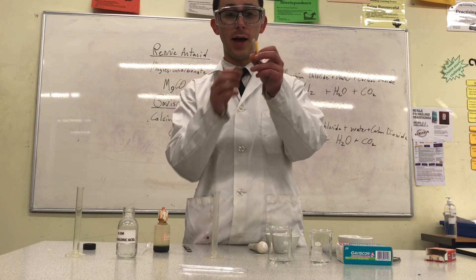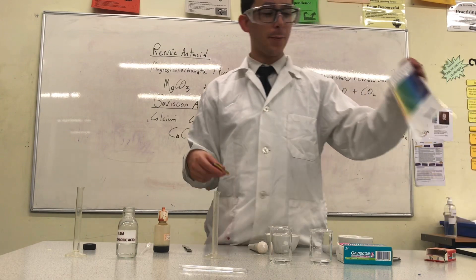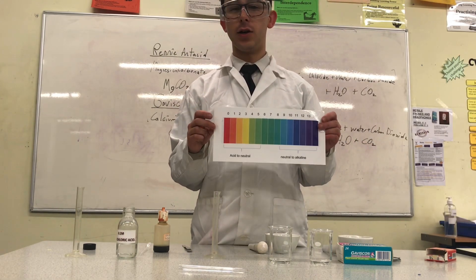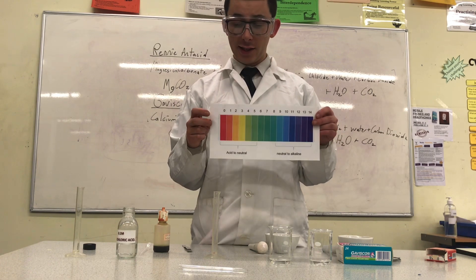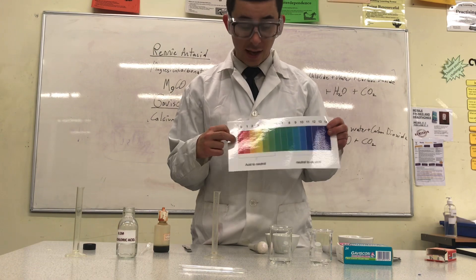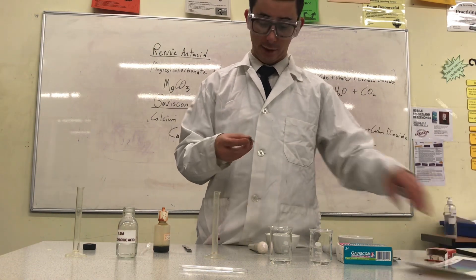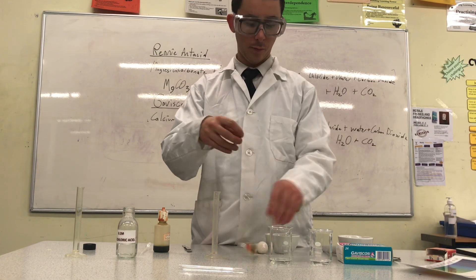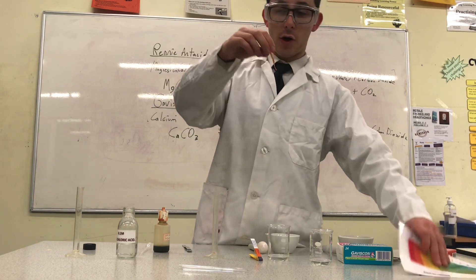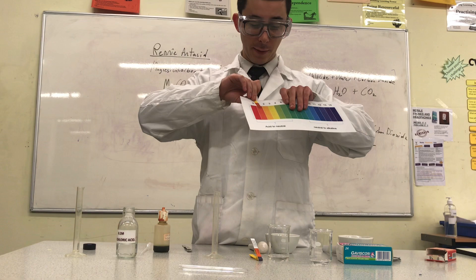Here I have what's called universal indicator paper. When I dip it into a liquid, it works just like universal indicator liquid — it tells me the pH by changing its color. I should expect it to turn red, as hydrochloric acid is a strong acid and has a very low pH. As you can see, when I put it in, it turns a reddish-orange color, giving a pH of about 1.